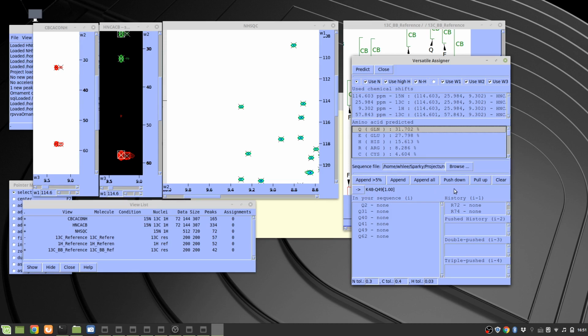You remember that there were at least 3 or more predictions for lysine, and then next to glutamine there is only 1 prediction left. If we click the next one, there are still 3, and then for the next one, nothing, nothing. So maybe we can choose one of them: 1 here, and then 1, 2, 3, so that gives 4 choices. It's a dramatic change.